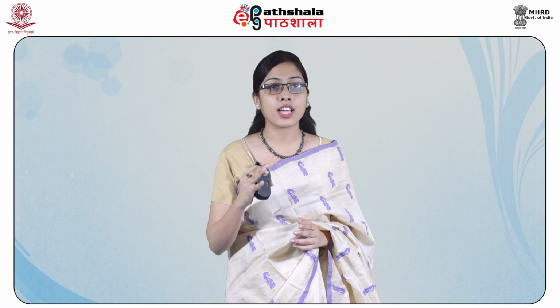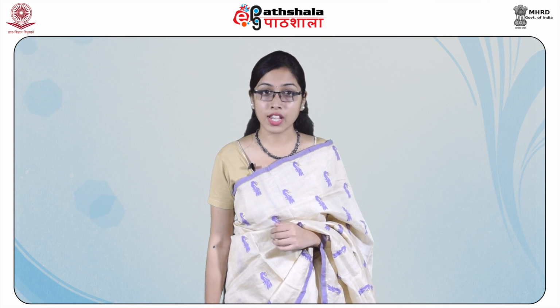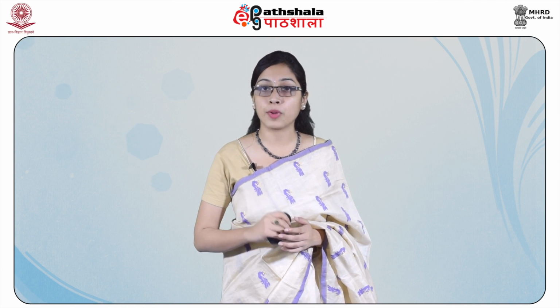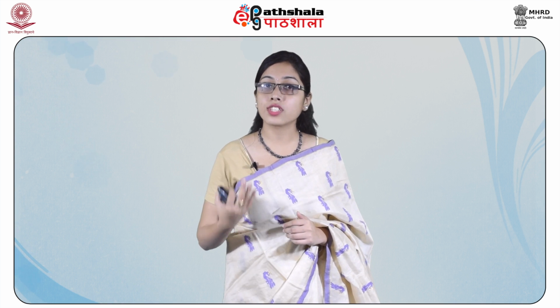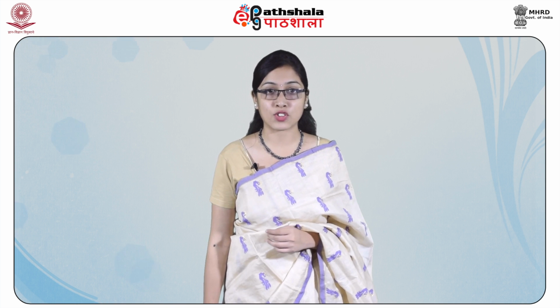Next is column chromatography. The stationary phase in case of column chromatography is held within a narrow tube via which the mobile phase moves through either by gravity or by pressure. Column chromatography can be further differentiated based on the types of stationary and mobile phases and the kinds of equilibria involved in solute transfers between the two phases. There are several classes of column chromatography such as gas chromatography, high performance liquid chromatography, also known as HPLC, etc.